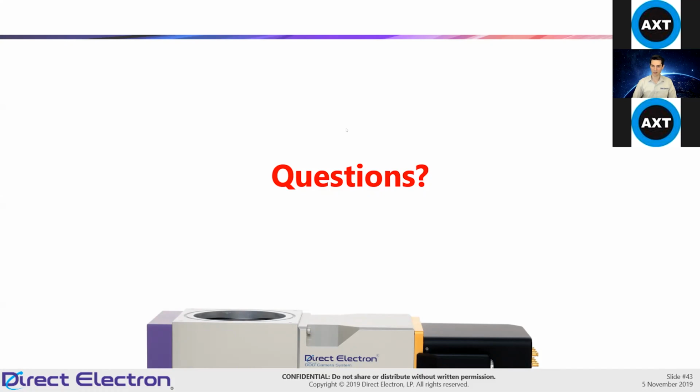And we have talked to them extensively about the 8K camera, and the aperture size on the end is sufficiently large for the entire field of view of the DE64 on the CEOS energy filter. There's more that's going to be coming out about that, probably in the next year, but they'll talk more about it when they're ready. And as far as I know, they'll be compatible with everybody's microscopes: Thermo and JEOL, I guess Hitachi as well.